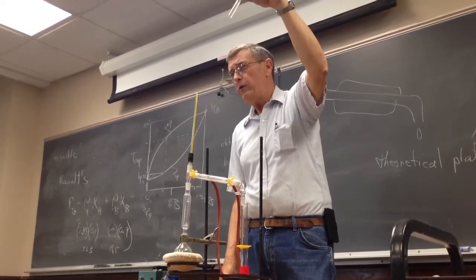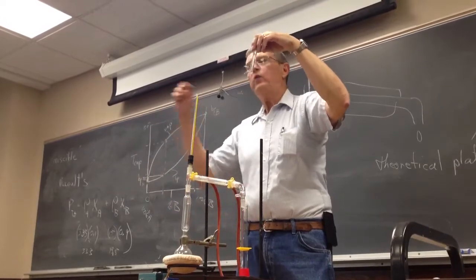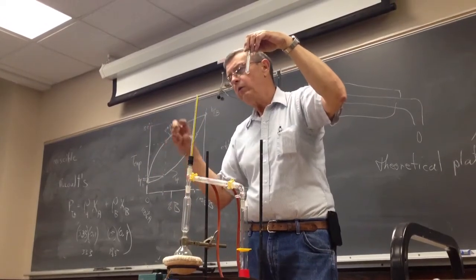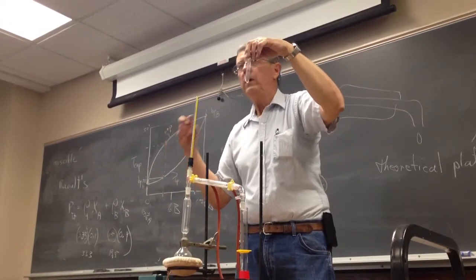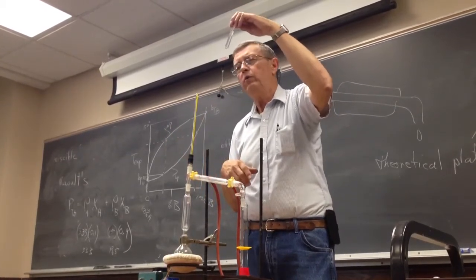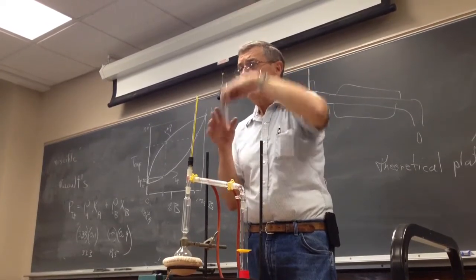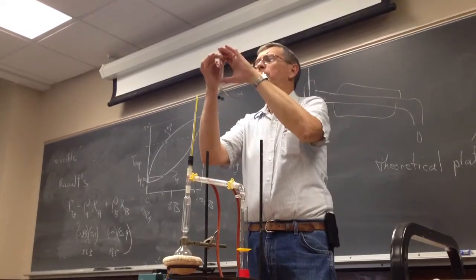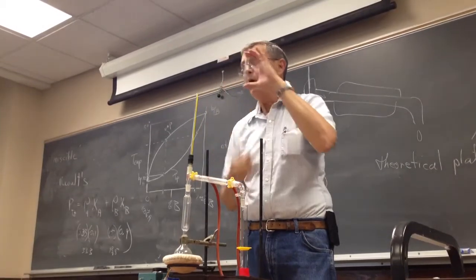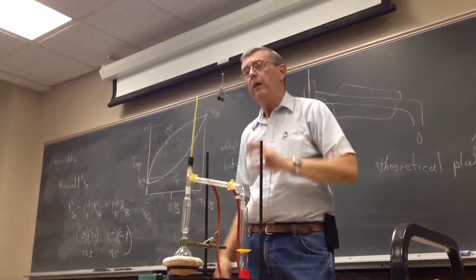This is not graduated, so before you get started, take 2 milliliters measured in your 10 mil graduate. Take 2 milliliters of acetone, pour it in one of these test tubes. Make a black mark. That's what 2 mils looks like. Take your other test tubes, line them up alongside of it, transfer that mark along. Now you know what 2 mils looks like. So now I'm ready to start my distillation.